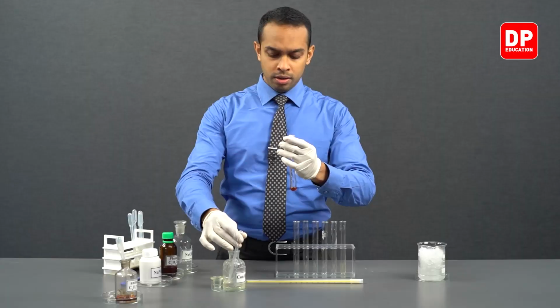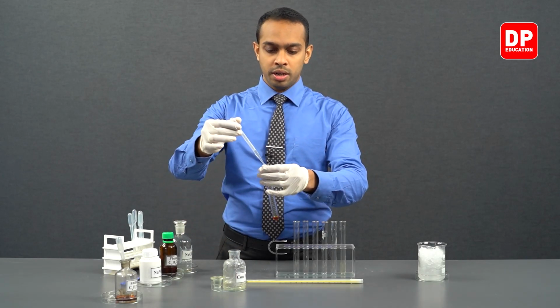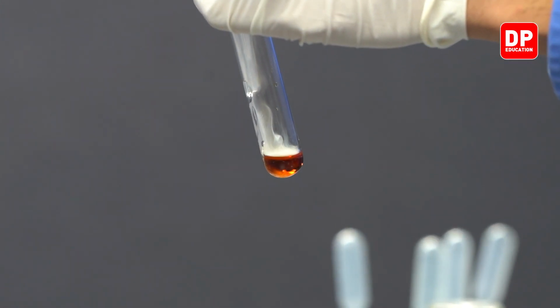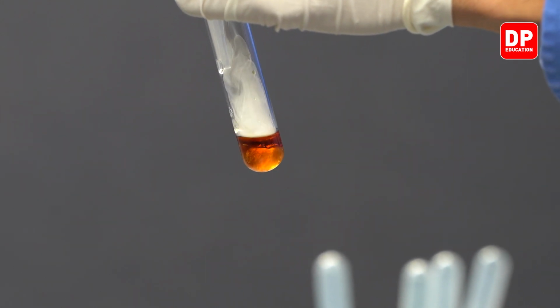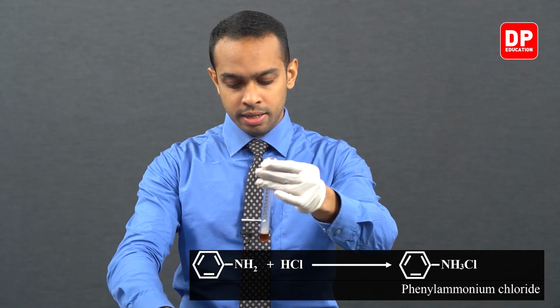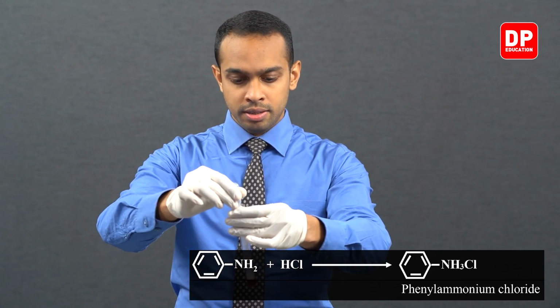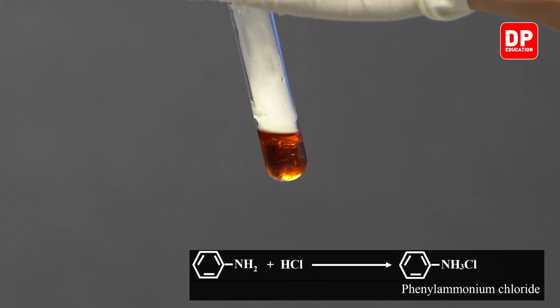Now, as you can see, we are adding concentrated HCl into an aniline sample that we have here. When we add concentrated HCl, it dissolves readily in concentrated HCl and forms a salt, aniline chloride.